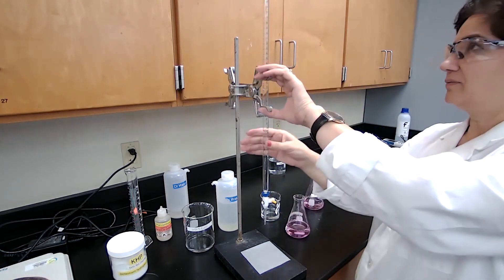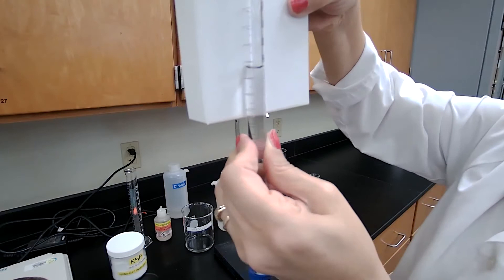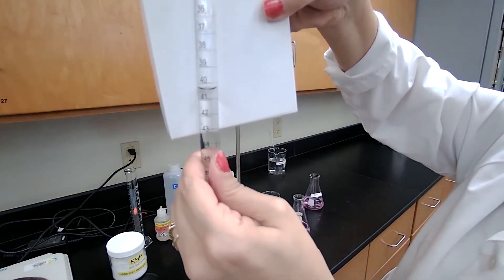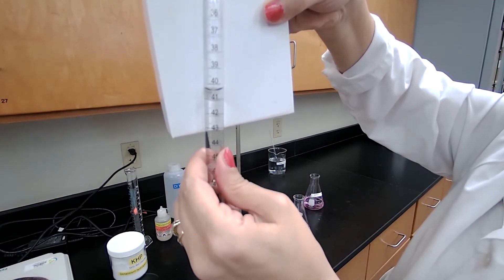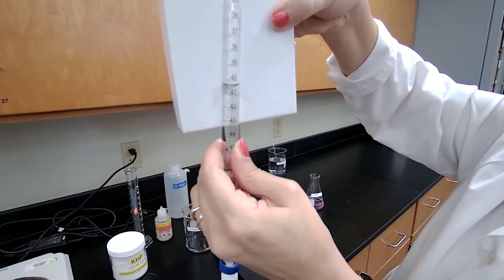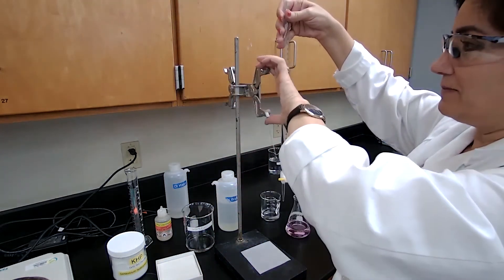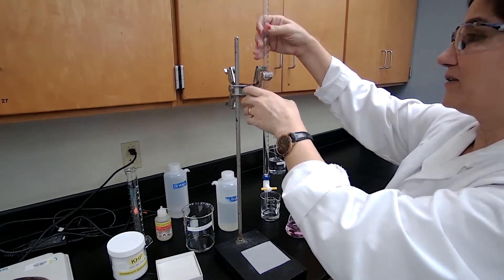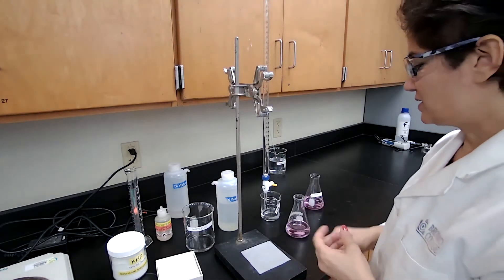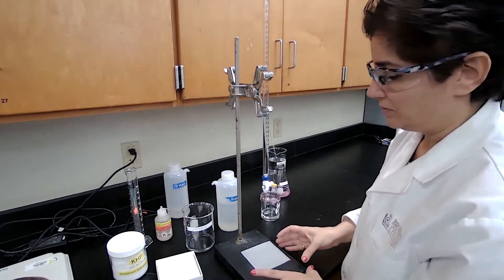Now we have the final burette reading between 40.3 and 40.4. You can estimate the last digit. The two numbers in mass of the KHP and the volume of the sodium hydroxide are close to one another. We don't have to do the third trial of the experiment. So we are done with the standardization of sodium hydroxide.